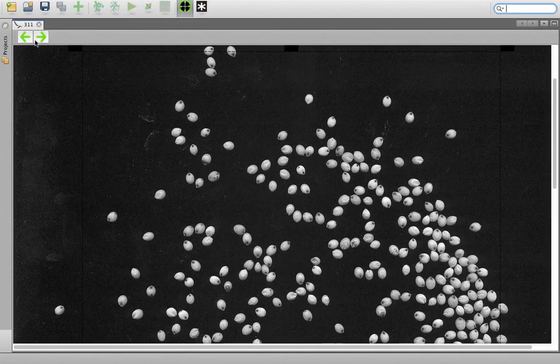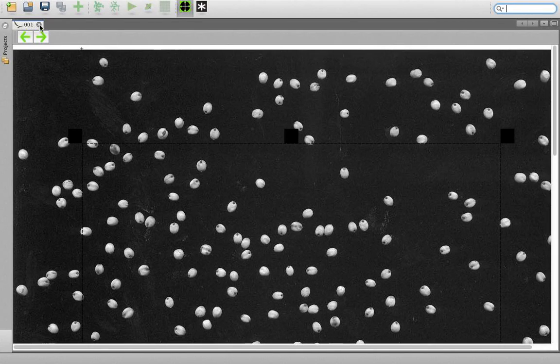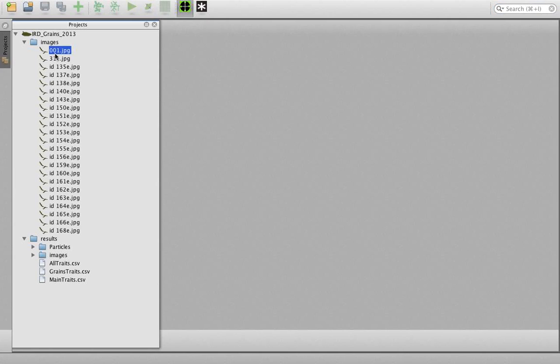they have dark background and lighter greens or particles. In this case, if we want to work with such images, we can group them in a project, and go here to this button, dark background, to tell the application we are working in the inverted mode.